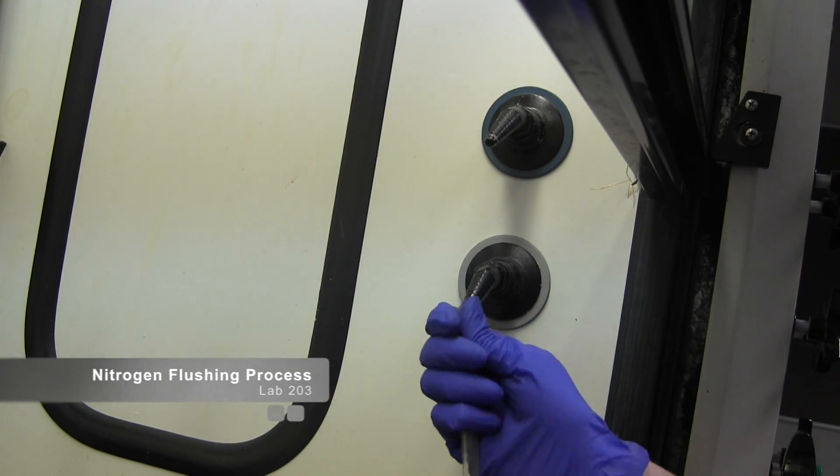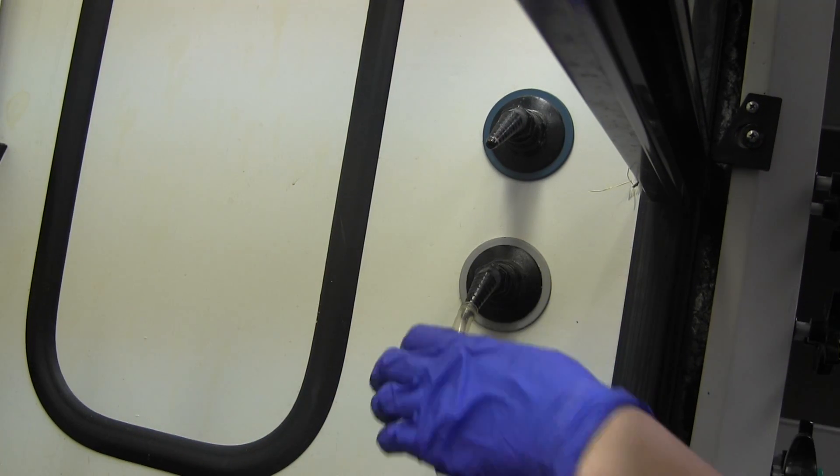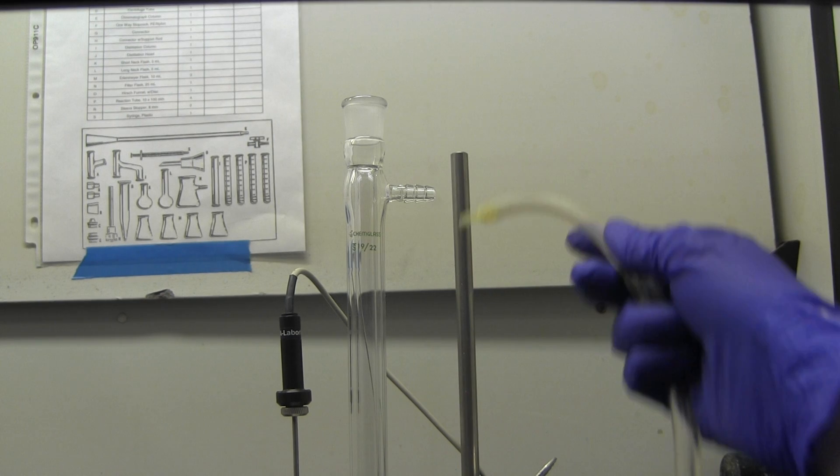To flush your system with nitrogen, attach a Teflon tube to the nitrogen outlet and insert the other end into your setup.